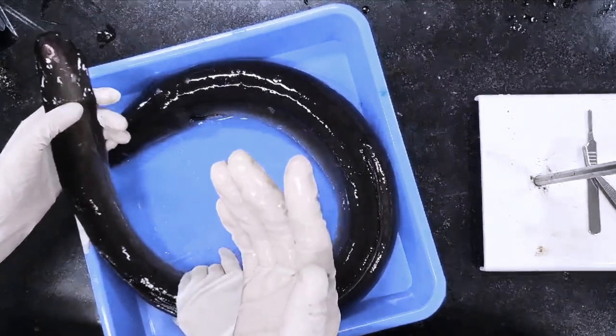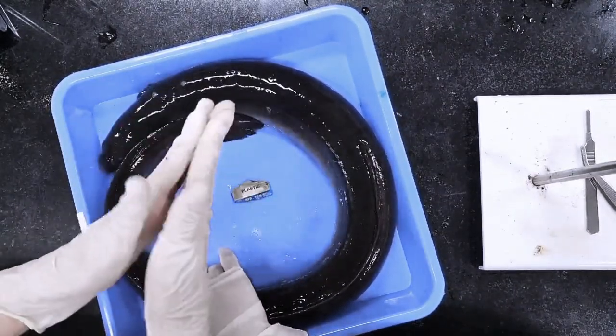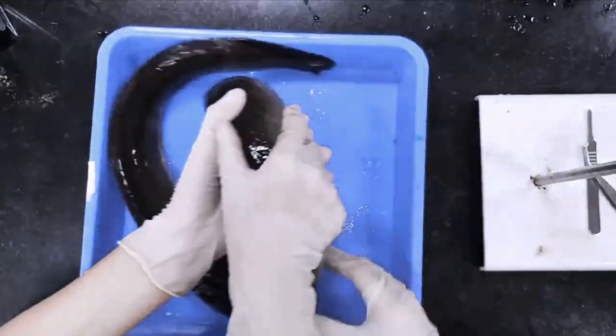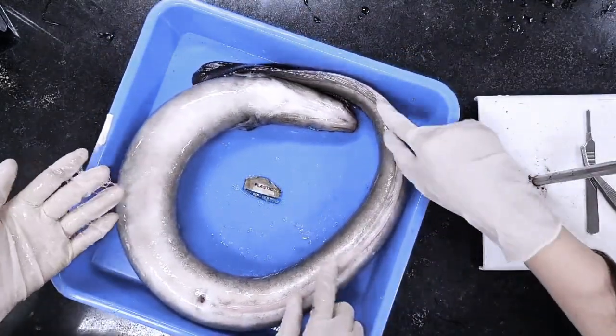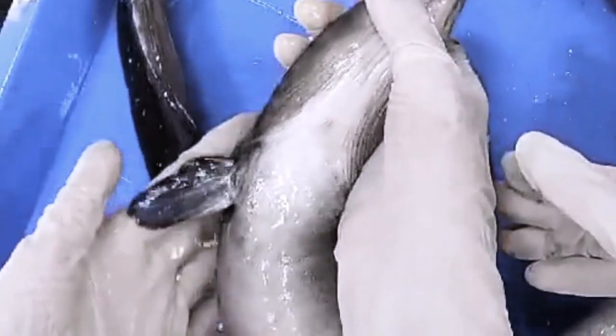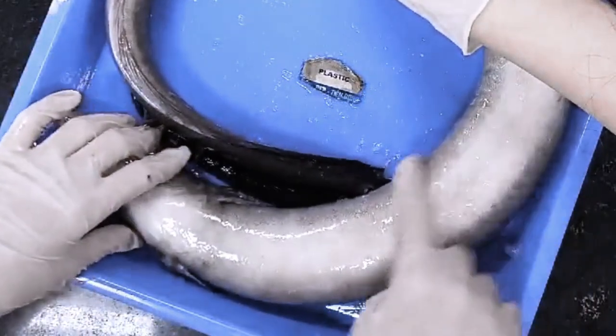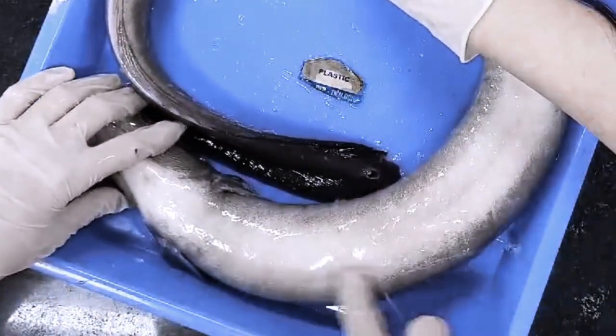The mucus that covers the eel's entire body protects the eel from pathogens and its surrounding environment. When flipped around, we can see its long anal fin which assists in swimming, and its anus. It has small pectoral fins to aid locomotion.